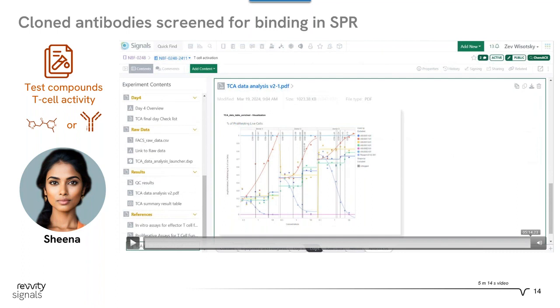Anyway, finally, what we will eventually be able to do, to bring us home, is, I guess this is as good a view as any. What we can do from our data processing center is generate a report. So all of the 11 steps that we have in this particular protocol, from the data ingestion of the raw file to the secondary data processing, we're looking at the various different T cell activation profiles.